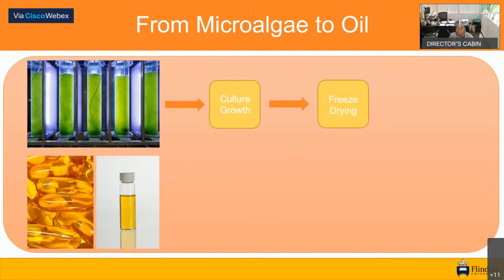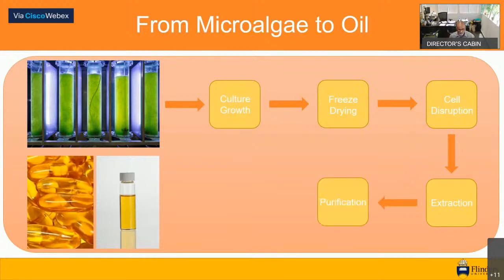Cell disruption procedures are divided into 4 major classes. These are physical, thermal, chemical, and biological. These are highly interchangeable, although some may be more suitable for specific species of microalgae. This allows the breakdown of cell walls to improve lipid availability, without which there may be a substantial loss of lipids. Lipid extraction is generally performed using one of 3 different solvent systems. These are the Folch, Bligh-and-Dyer, or Soxhlet methods. All 3 of these involve the use of hydrocarbon solvents to facilitate the transition of lipids out of cells and concentrate them in the extract. Due to the toxicity of most common solvents, more environmentally friendly solvents are now being considered. Although the best existing systems still involve either hexane or the pairing of methanol and chloroform. The raw lipid extract can be put through numerous analytical tests to determine overall yield and individual fatty acid quantities, which we will discuss in more detail later.